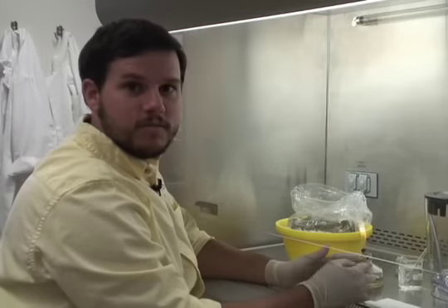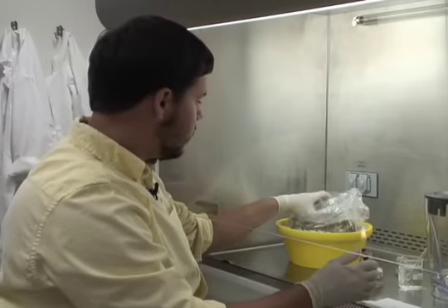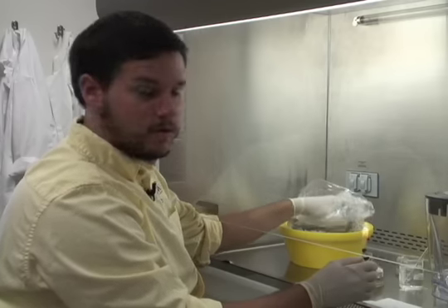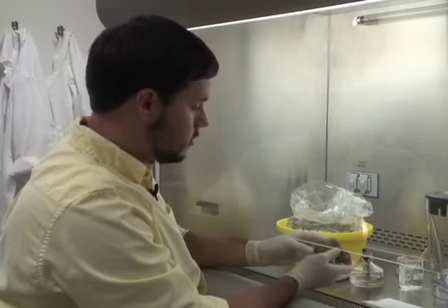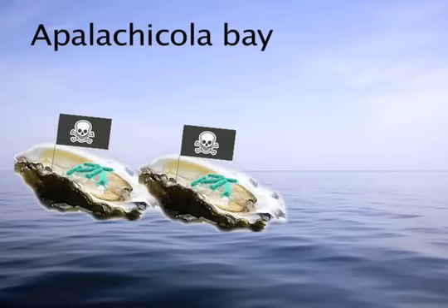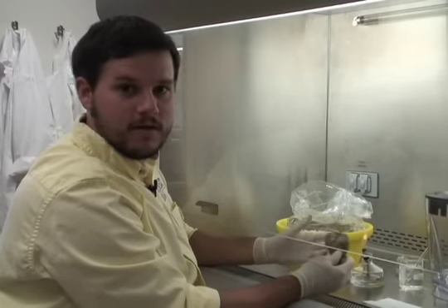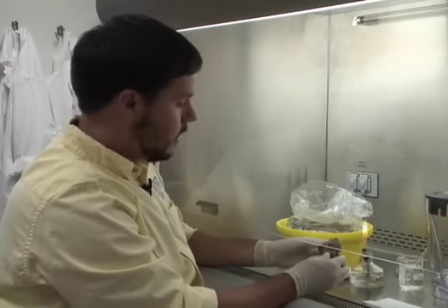One aspect of my project is examining how bacteria live on oysters. To do that, we actually have to infect oysters with bacteria. We get oysters in from Florida. These particular ones are from Apalachicola Bay. Once we get them in, we incubate them in water and then we introduce the bacteria that we have engineered into them.